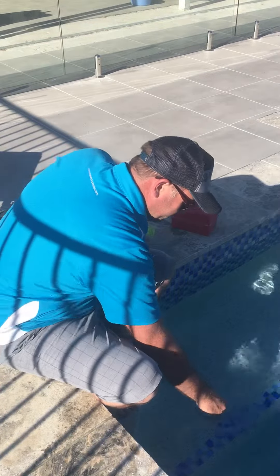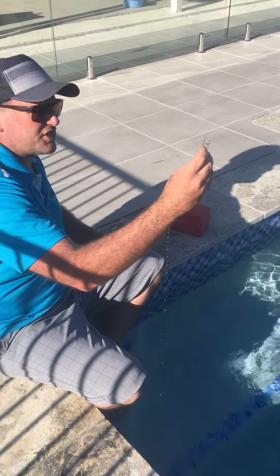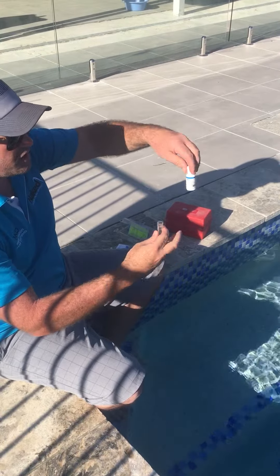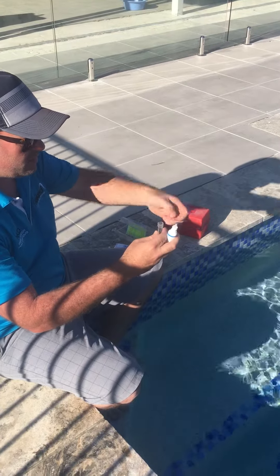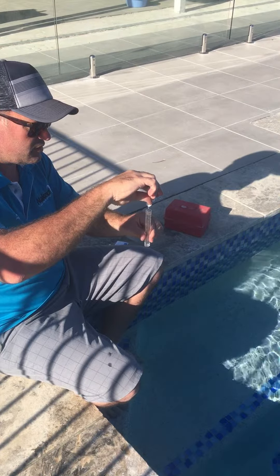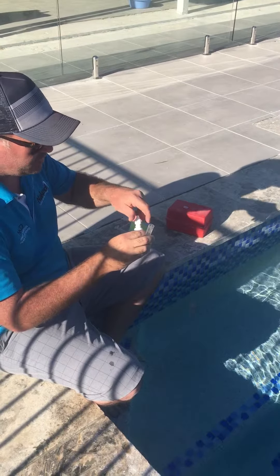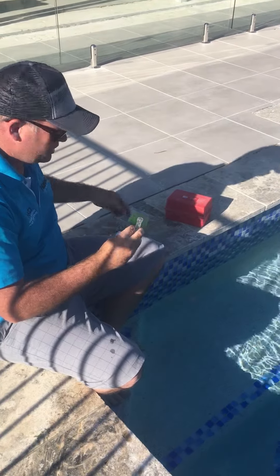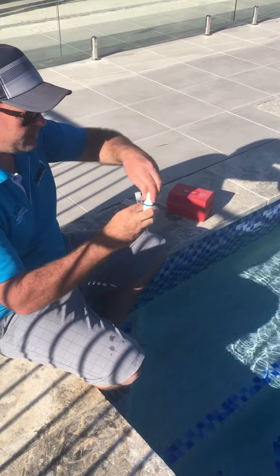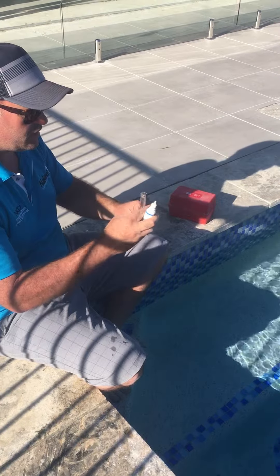All you do is take the vial and fill it up to the 10ml line. First, grab Copper A and add five drops. Put the lid on, give it a bit of a shake, and leave that for about three minutes. I'll be back to show you how to read your copper.